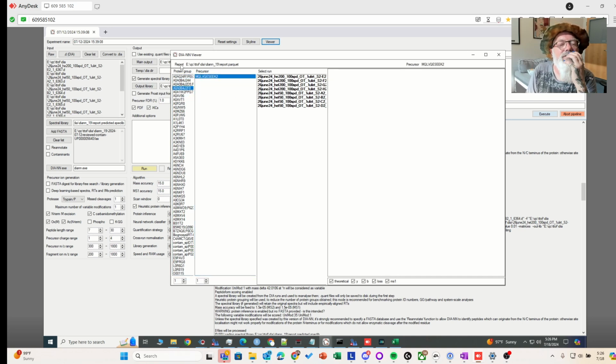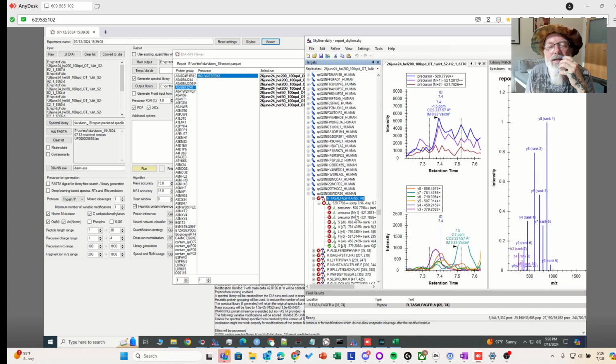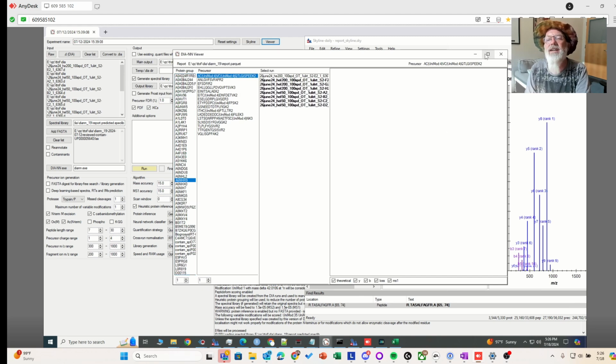Where can you find stuff? Looks like you can't. Doesn't look like there's a find function, which could be annoying. I don't want to look through it and try to find it. Is there a Control F? No, no Control F. So it doesn't look like there's any kind of finding feature that I know of, but maybe there will be some soon.